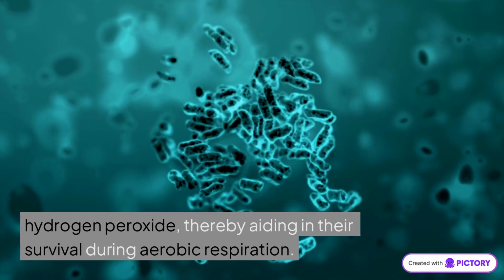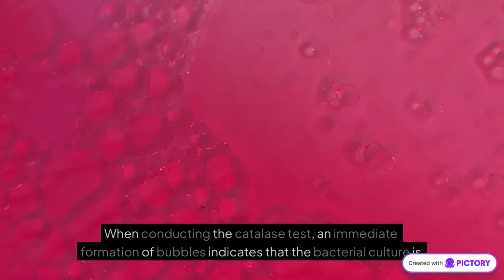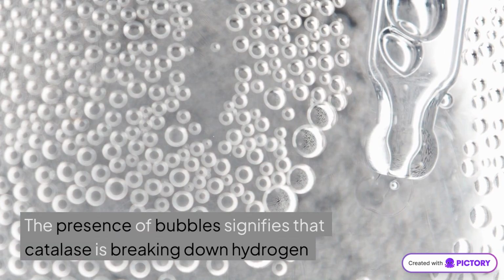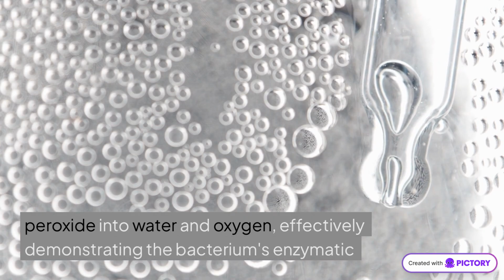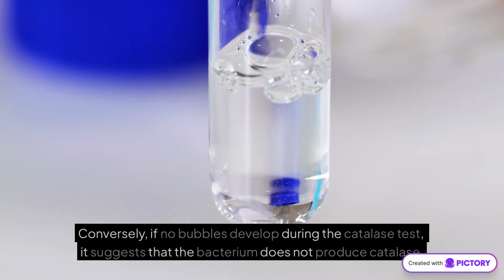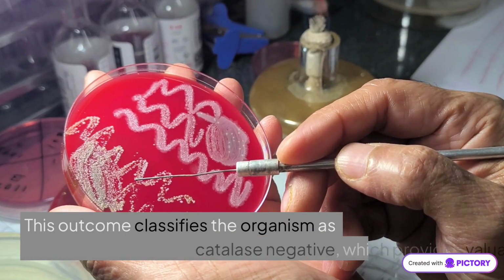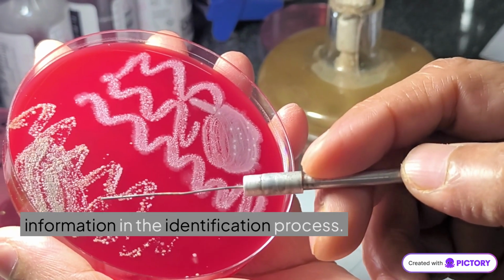survival during aerobic respiration. When conducting the catalase test, an immediate formation of bubbles indicates that the bacterial culture is catalase positive. The presence of bubbles signifies that catalase is breaking down hydrogen peroxide into water and oxygen, effectively demonstrating the bacterium's enzymatic ability. Conversely, if no bubbles develop during the catalase test, it suggests that the bacterium does not produce catalase. This outcome classifies the organism as catalase negative, which provides valuable information in the identification process.